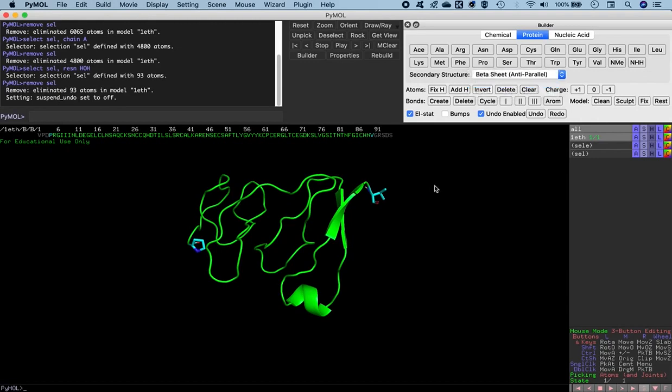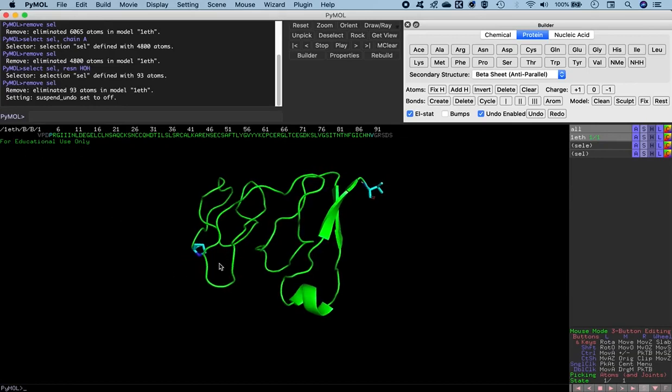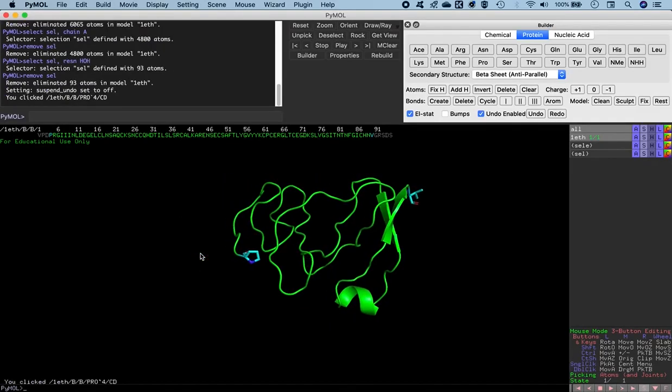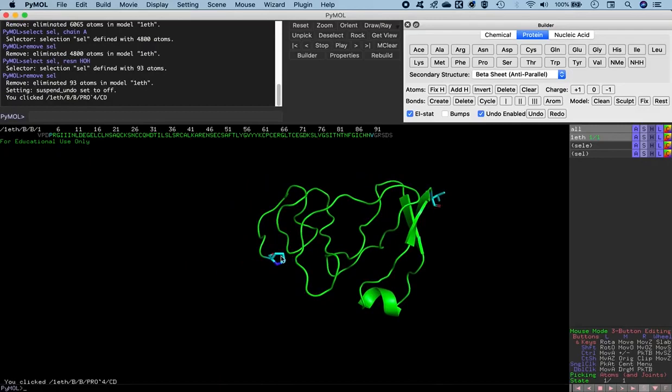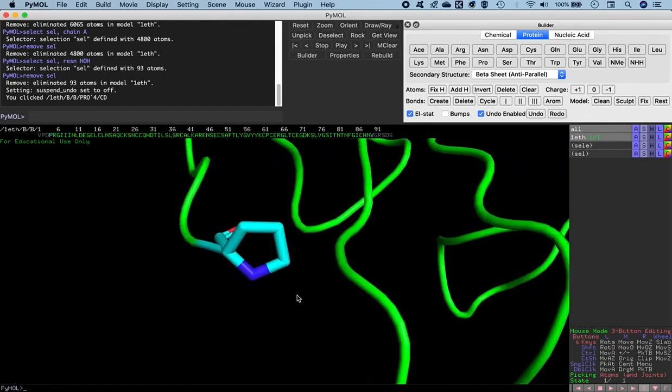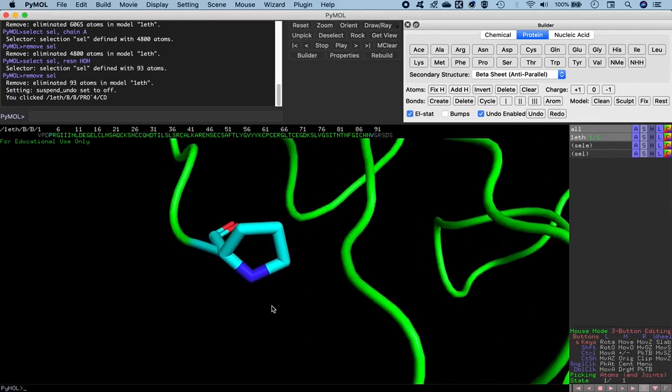So select this. And now we got to annotate the specific atoms on top of which we will be building all these residues. So let's go to the N-terminal first. So if you want to focus on this particular residue, which is proline out here, as you can see with the 5-membered ring that's being annotated, we click on the middle mouse button. So once you click on the middle mouse button, this brings into focus the proline residue in the N-terminal. And then we drag along by clicking on the right mouse button in order to zoom into the structure. And you can clearly see now.